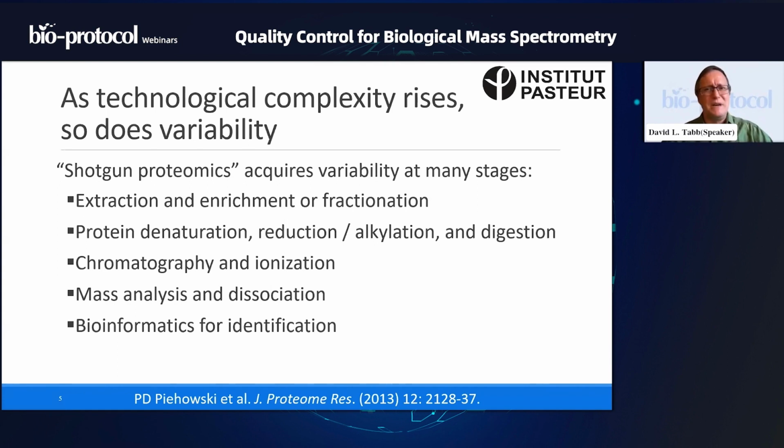Now, this might seem like heresy. If you have the same software and you run it the same time all over again, don't you get exactly the same result? But frequently, there are some random factors in how software proceeds in order to create a random sampling for computing false discovery rate, for example, that even if you run exactly the same search results through exactly the same pipeline a second time, you may see slight differences in the numbers of spectra identified, for example. So it is not the case that bioinformatics is rock solid and it can always be counted upon for giving us exactly the same result.